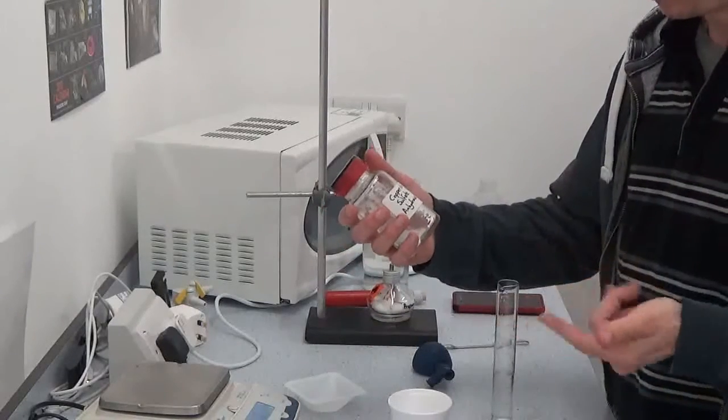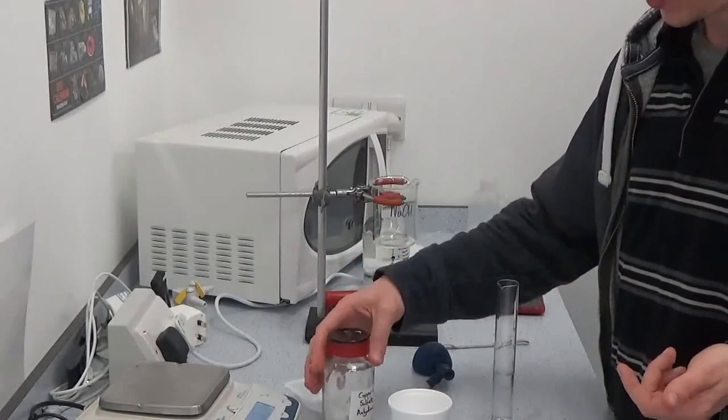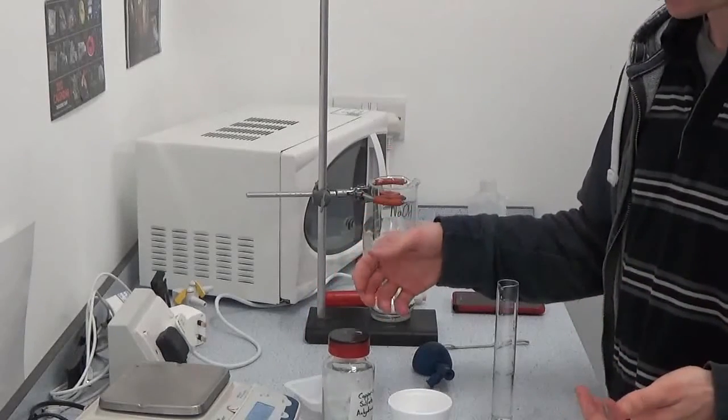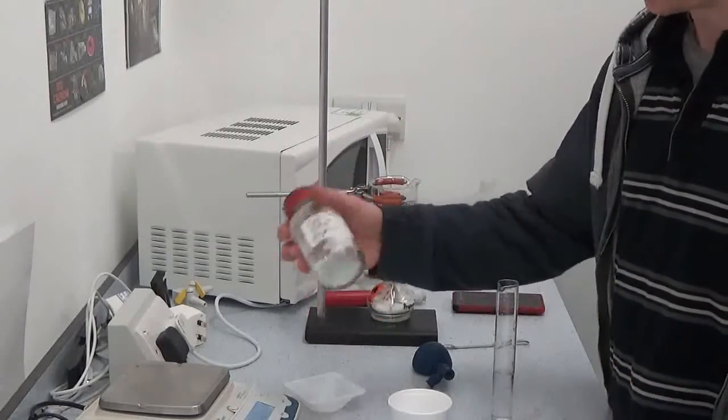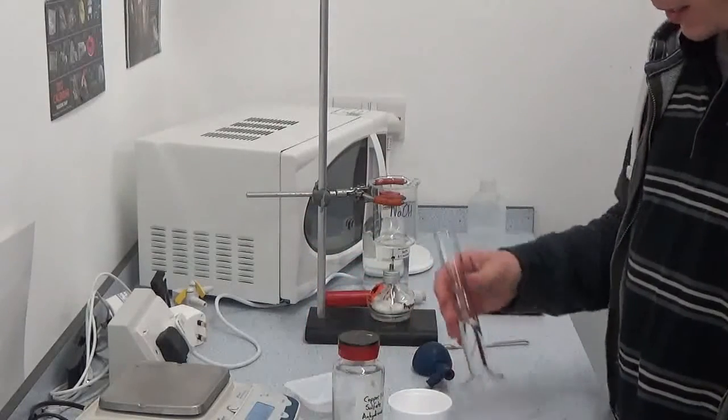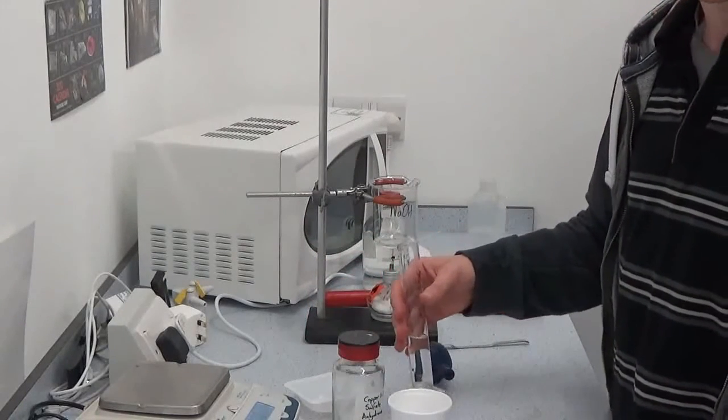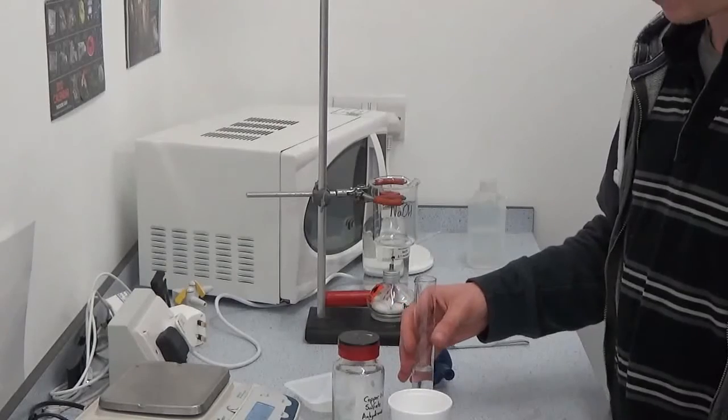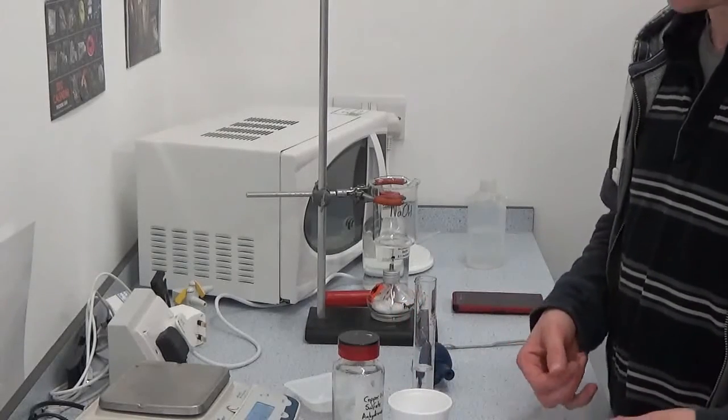What you'll have is anhydrous copper sulfate and also some hydrated copper sulfate, and you're required to weigh out a certain mass of these and add them to either 24 or 25 cubic centimeters of water respectively and record the temperature change.